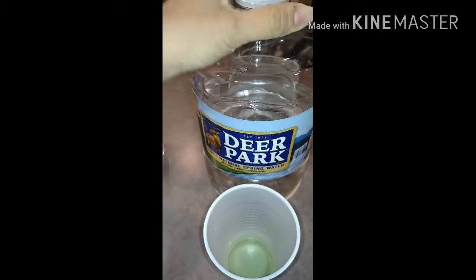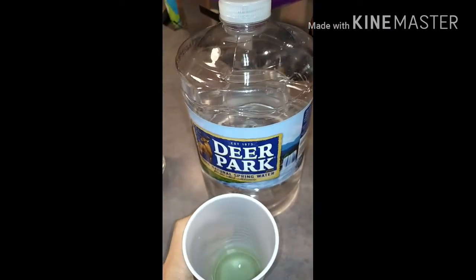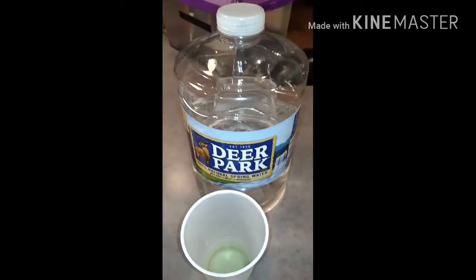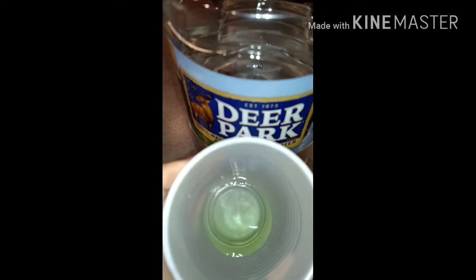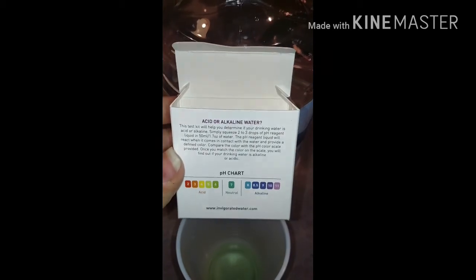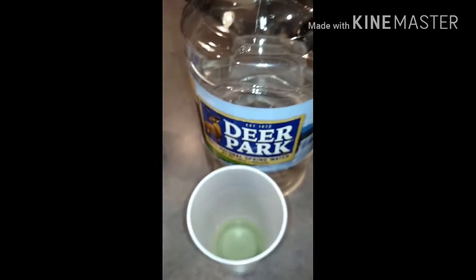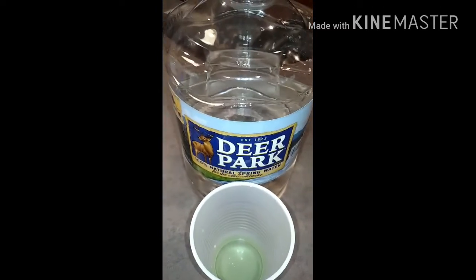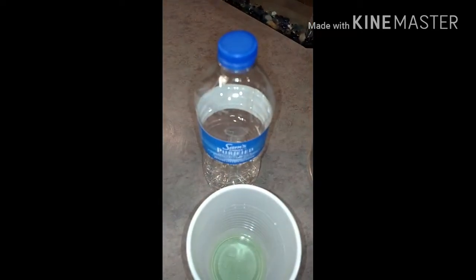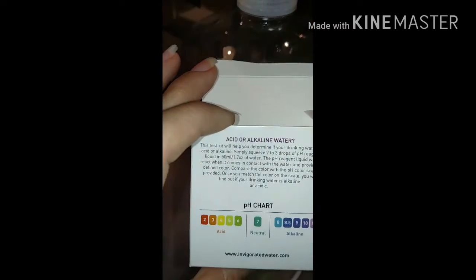We got Deer Park. I think I gave a dollar for this and I think it's right at a gallon. We see a green color here, and that matches up with number five on our chart — acidic. So the results: Deer Park is acidic, coming in at a five on the chart. Seven is neutral, neither acidic nor alkaline. So Deer Park is coming in at a five.